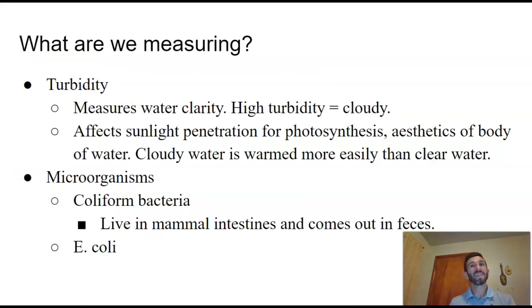Turbidity just means it's the total suspended solids, the TSS. It measures how clear your water is. Okay, so if you have high turbidity, that means your water is cloudy. So there's good and bads about this. You just have to know what that body of water that you're testing is supposed to be like. Okay, if the water is too cloudy, it can affect sunlight penetration, which will decrease photosynthesis for that particular area. Okay, and of course that will affect the ecosystem. Obviously, the aesthetics of the body of water. Okay, people don't usually like to swim or to have fun in cloudy water.